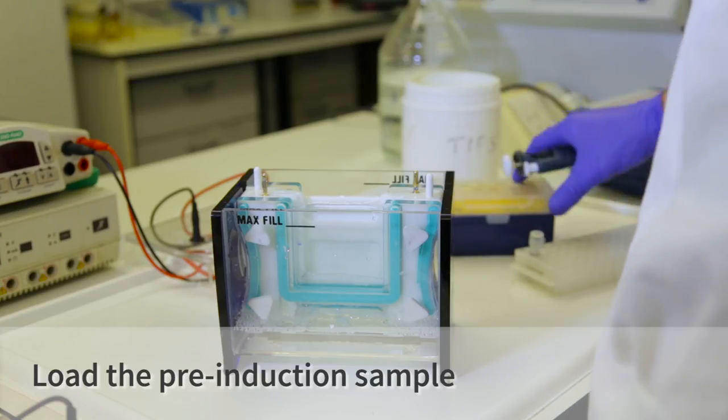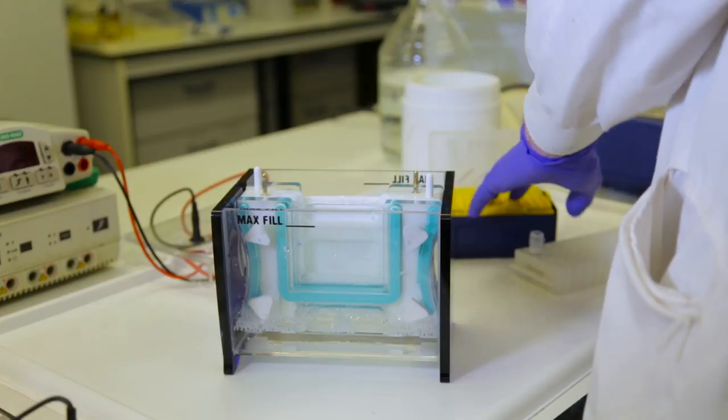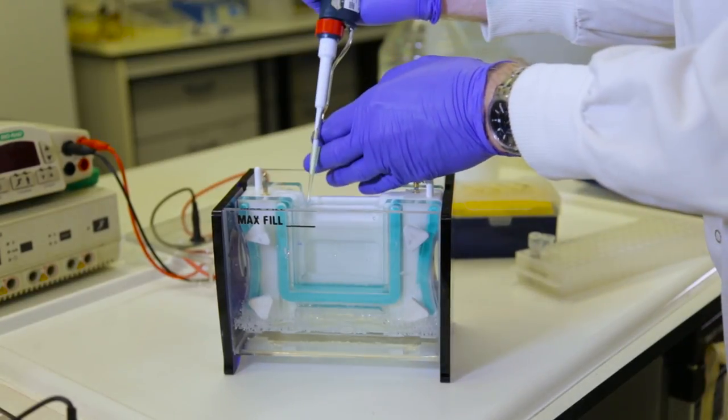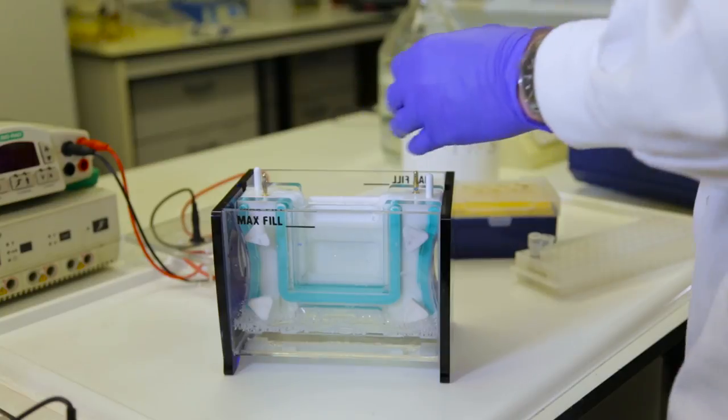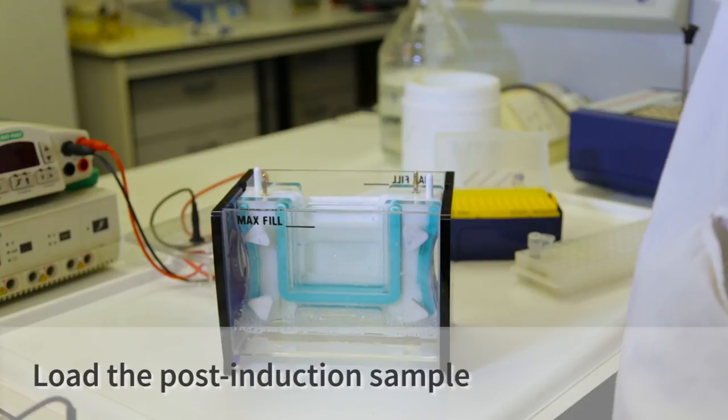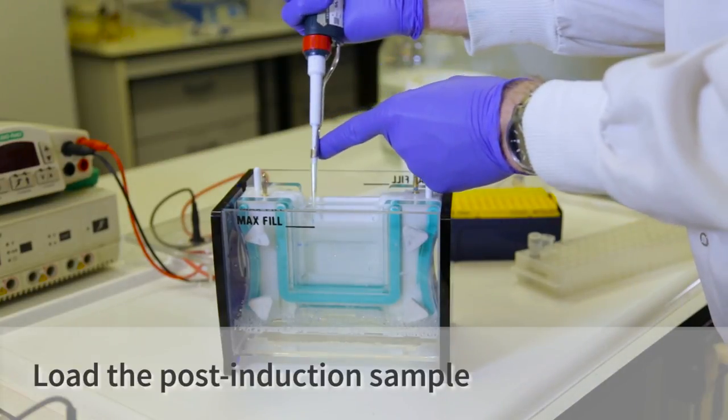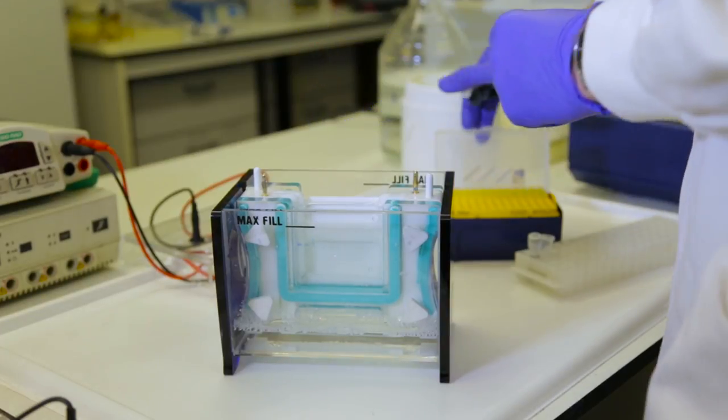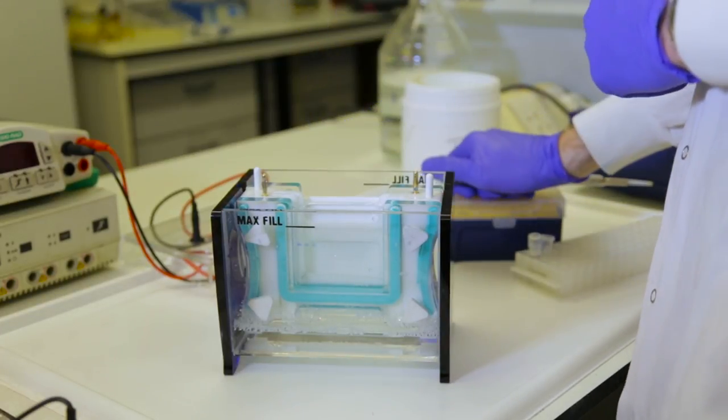The next sample we're going to load is the pre-sample. This is taken before we induced our protein, so it should be telling us exactly what proteins the E. coli was producing before we induced ours. Now we're going to load the post-sample. This sample was taken three hours after we induced, so hopefully we should see a band where our protein is present.